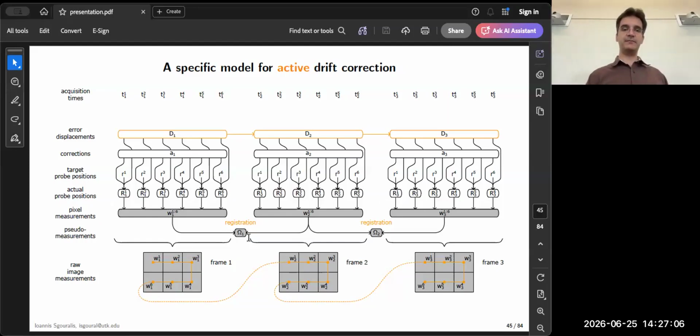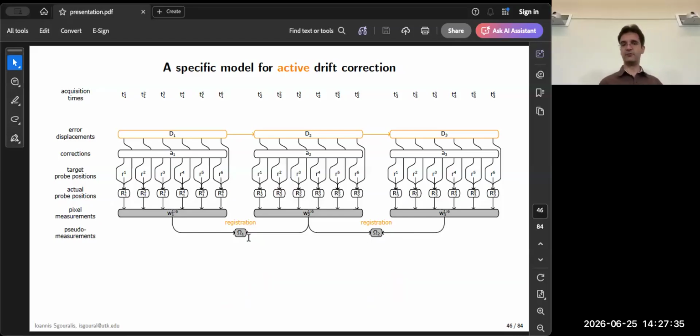So what is my omega 1? Basically, I will compute the omega 1 by trying to find out the best way to translate my second frame relative to the first frame. Now, why are these pseudo-observations, the omega variables, important? Because now I can start building my model, a more quantitative model than what we had before. So let's think a little bit about what those omegas may actually represent. The omega variable is, as I mentioned already, the optimal translation that we need to apply in one field of view to match the subsequent field of view.